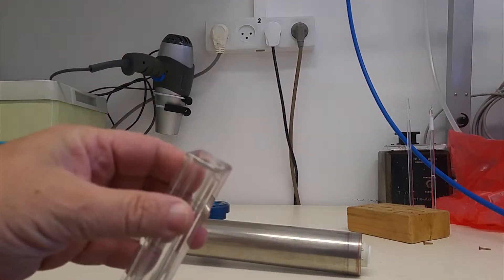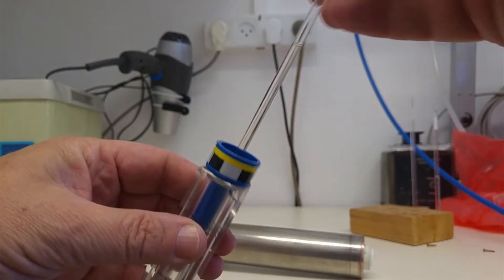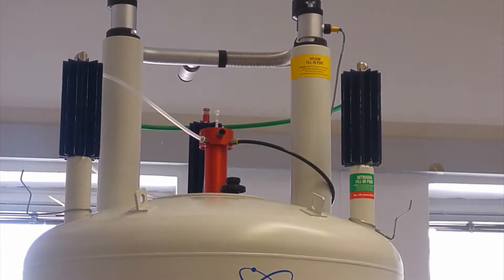We use spinners to hold NMR samples that are placed inside the spinner to a certain depth, so they fit right in the middle of the probe. Then we put them into the magnet on a column of air and let them sink into the magnet.